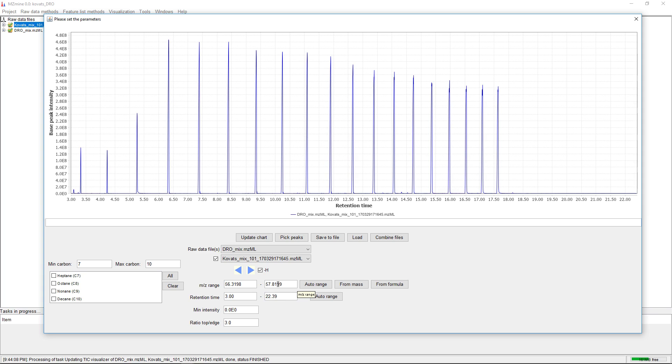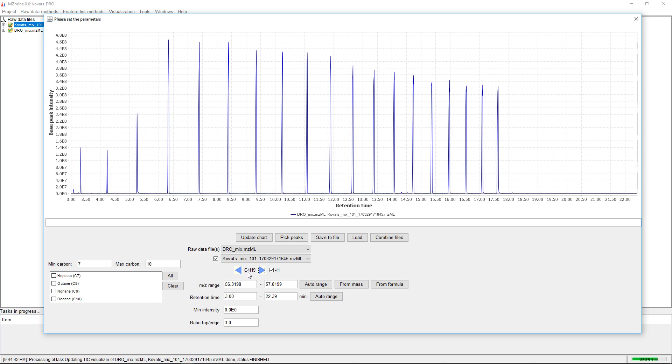For the mz range, we can type in values, use the formula, or use the quick solution with these arrows. The arrows loop through the different alkanes.